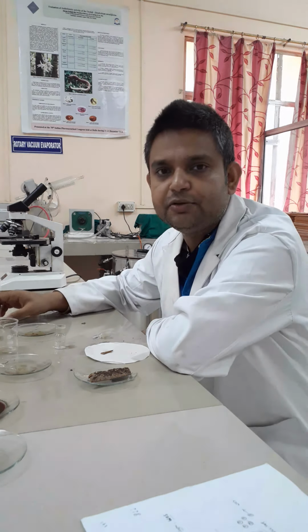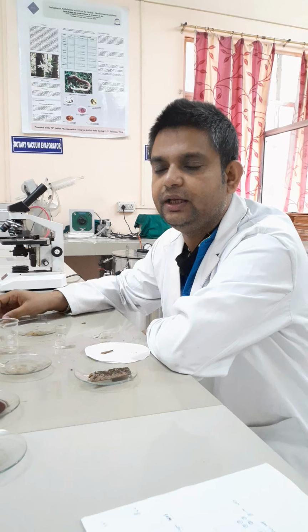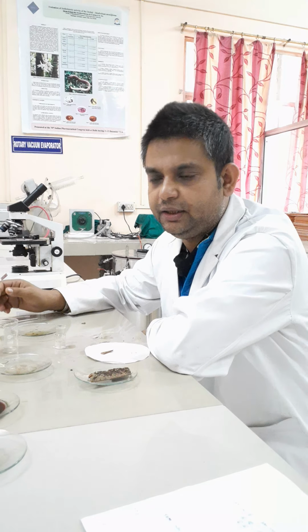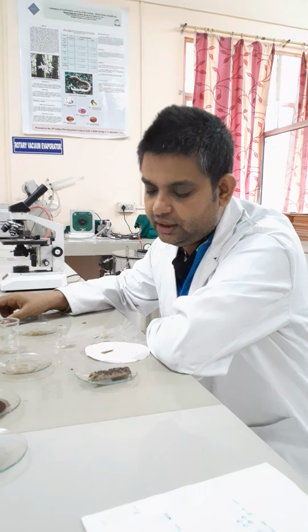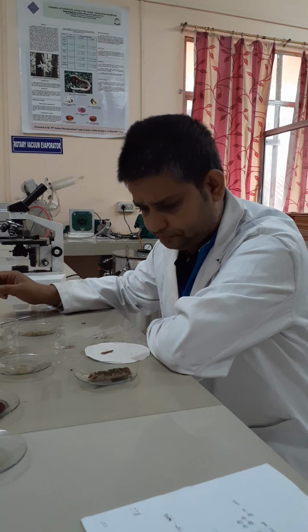The main constituent present in Cinchona is quinine, which is an alkaloid. Due to the presence of quinine, it shows anti-protoplasmic poison activity, and due to this activity, it is used as an anti-malarial drug. Let us see the transverse section of the Cinchona bark.